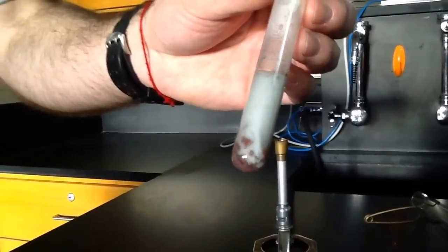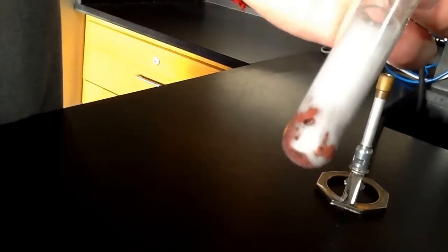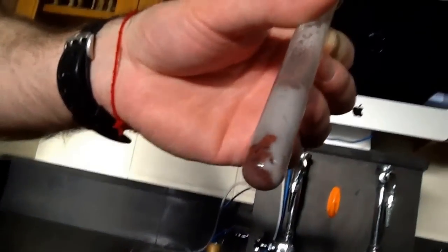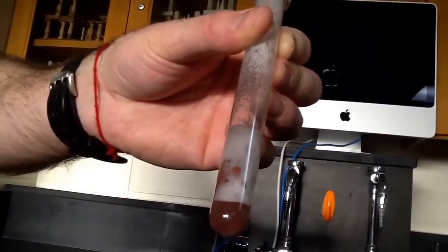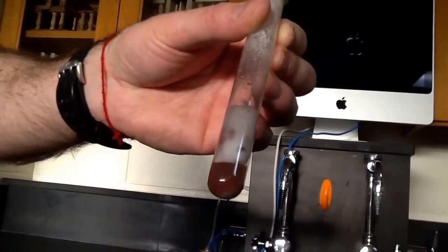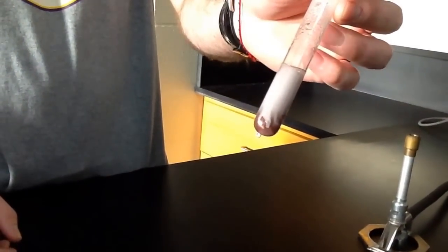Okay. So right now, another thing you can do to test that, is this a chemical reaction? It is getting very, very hot. At the very bottom, you might be able to see that the solid that we have in there now is turning kind of a brownish red color. And there we go. Sometimes from the heat, everything kind of gets lifted up, and then the gases. So we can see our solid in there is turning red-brown. That's actually copper we're making. So we're going from our copper ion, which was our copper solution, to the copper solid.